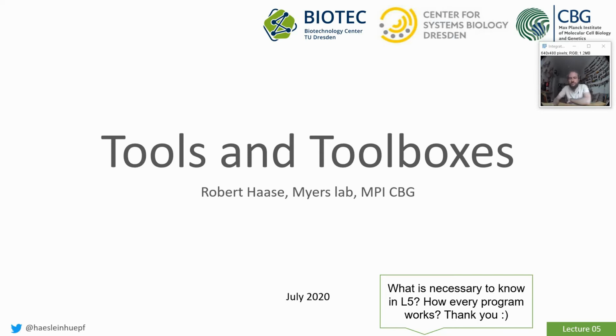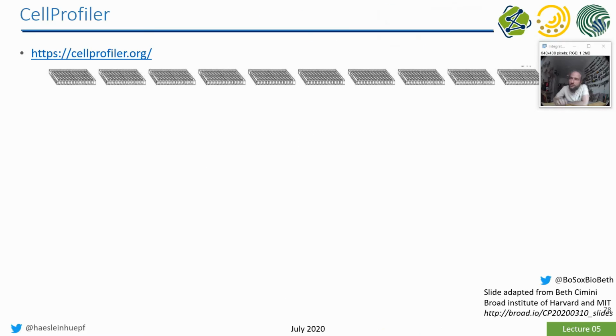So, there's no general conclusion for stuff like that. So if you are confronted to automated microscopes which spit out billions of images every day, which all look kind of similar, but all are also a little bit different, then you want to go for Cell Profiler.